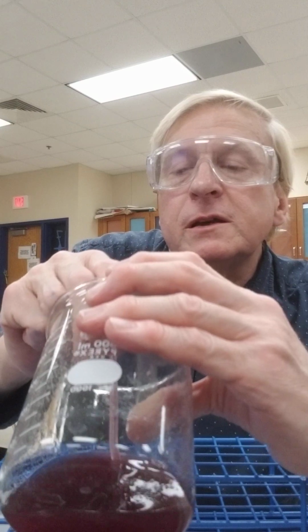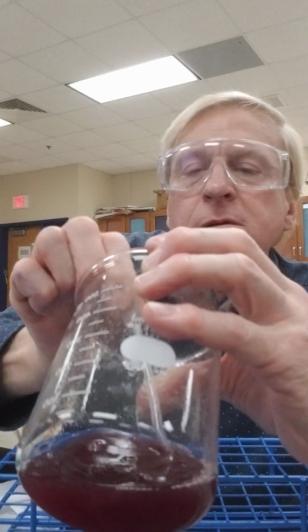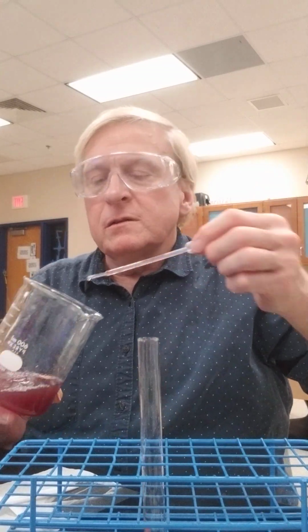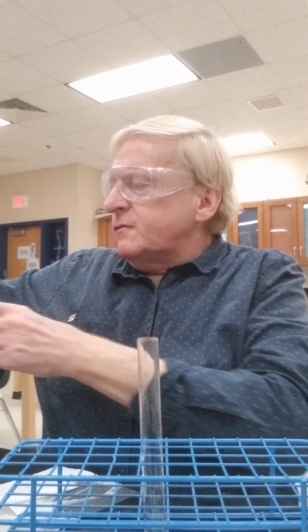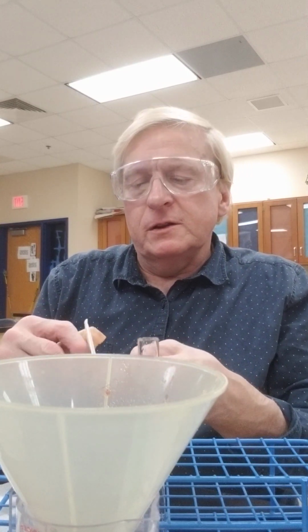I probably could have used just a little bit less of the isopropyl alcohol. You can actually extract the DNA strings right through here. There's a gob of it on here. Sometimes with the stirring rod you can just pull it out in strings. Another thing you can do, if this isn't becoming very satisfactory, I'm going to put a second filter paper here. I put a little too much isopropyl alcohol, so I want to make sure I can find the DNA really well.